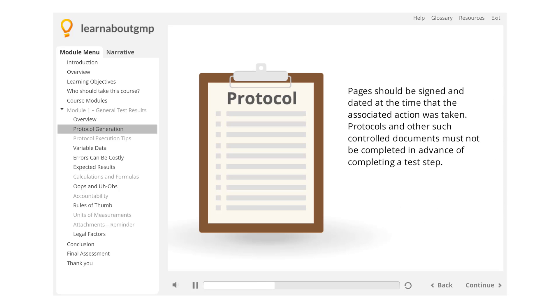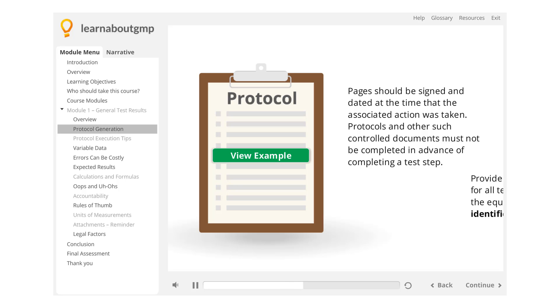Pages should be signed and dated at the time that the associated action was taken. Protocols and other such controlled documents must not be completed in advance of completing a test step.